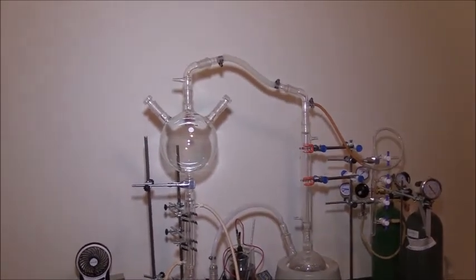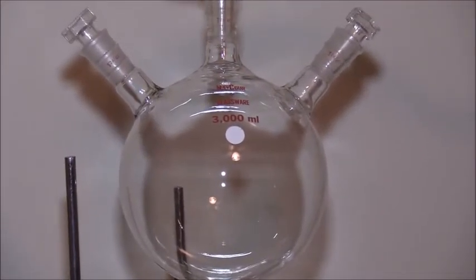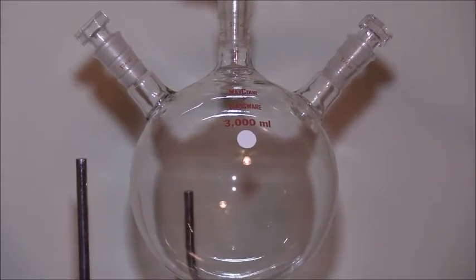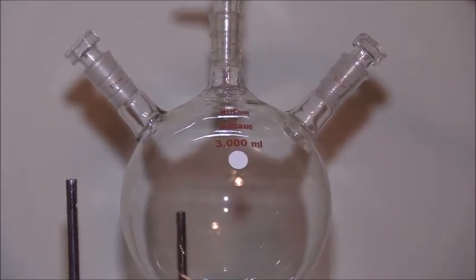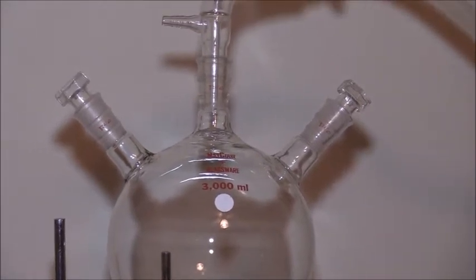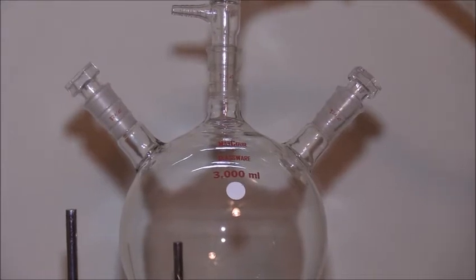As you can see, this is my 3000 milliliter custom-made electrode flask. It doesn't have electrodes in it now, but what I'm going to do is replace those stoppers that you see with silicone stoppers which have electrodes implanted in them.